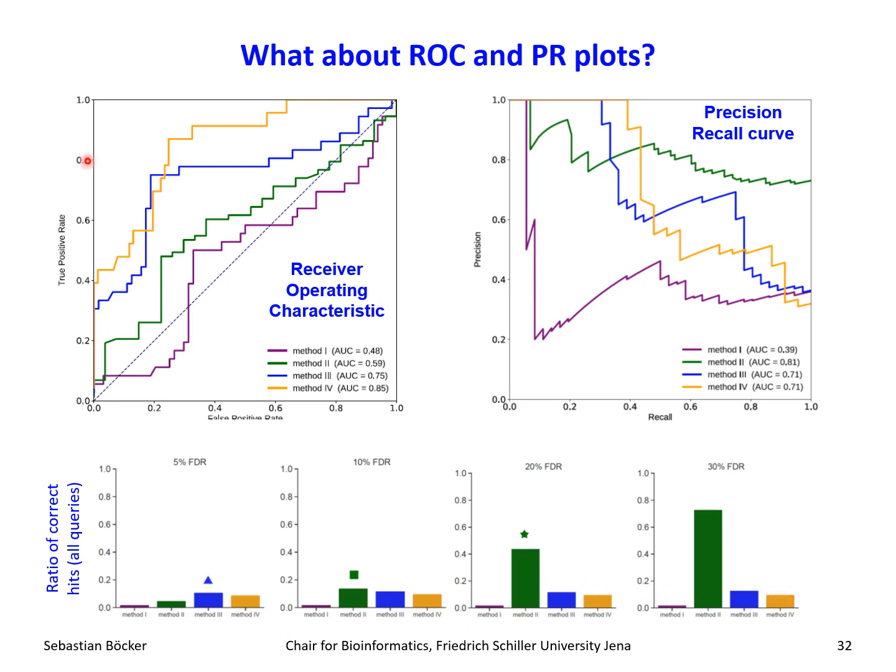So can you see this information in those 2 plots? Well, I cannot. I don't know how to see that. I don't know how to tell you that the green method is actually by far the best method if I look at this plot. And the problem with that is normalization. The normalization of those plots is not really the best one for the application or what we have in mind, which is compound annotation.